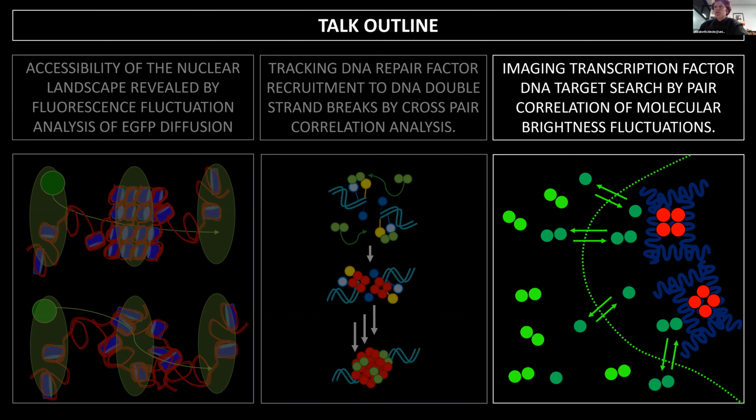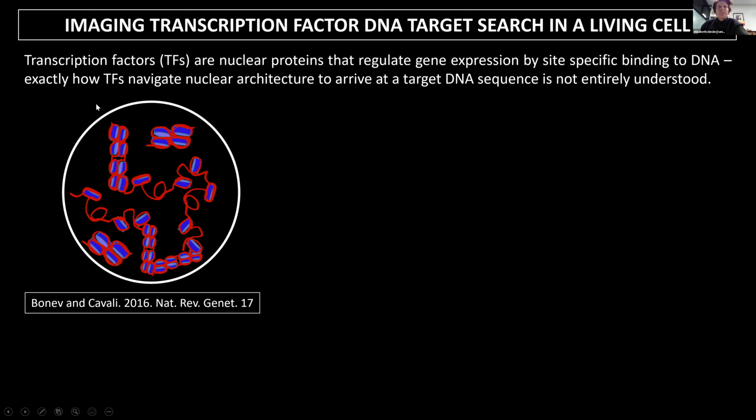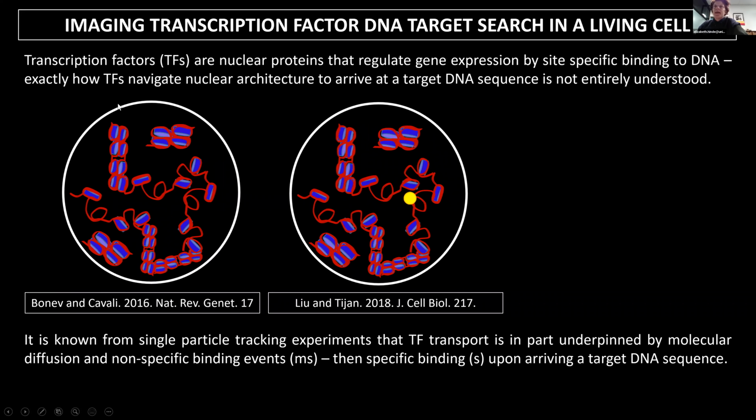So to address this issue, I was just going to mention as the last topic of this talk, a new method where we're looking at pair correlation of brightness fluctuations. So transcription factors regulate gene expression by site-specific binding to DNA.